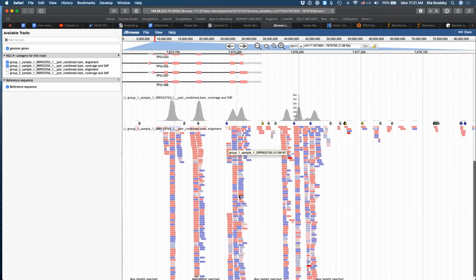Okay, now you also have blue and red. Blue and red indicate paired-end sequencing. So for each read that comes from one direction and the other direction, both are aligned, and that gives you higher reliability of the actual sequence, because as you remember, the sequencing itself also has a lot of error rates. There are other reads that are not such good quality.